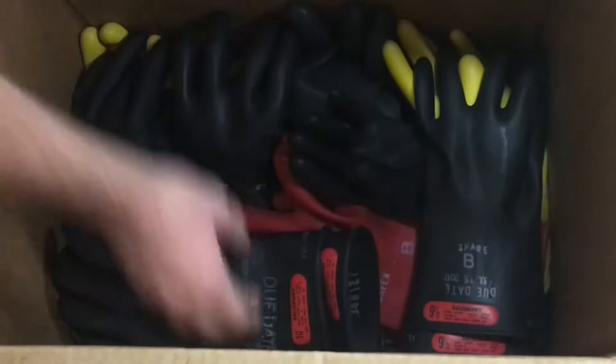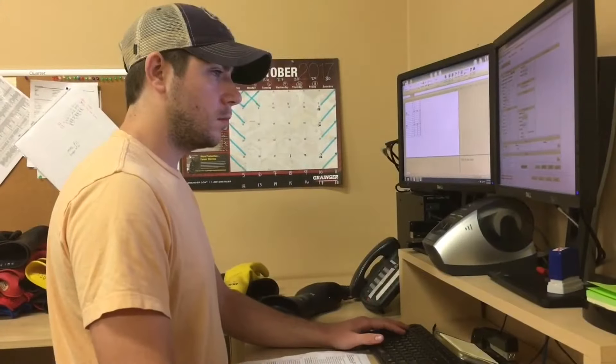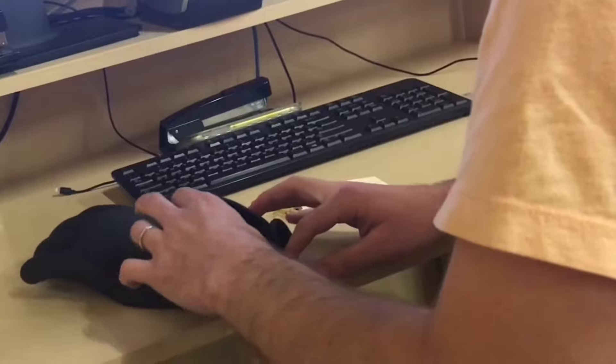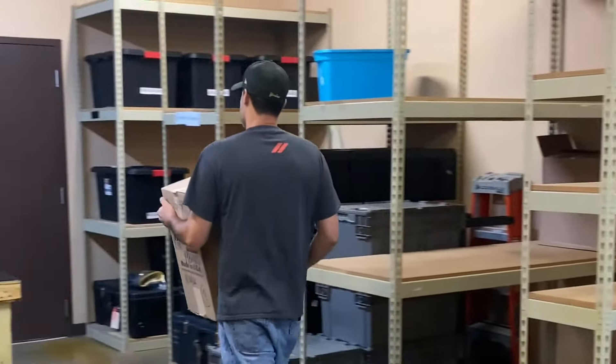Gloves start in our receiving department and are entered into our system by pairs to accurately detail the quantity and characteristics of each glove. They are brought into the washroom to start the cleaning process.